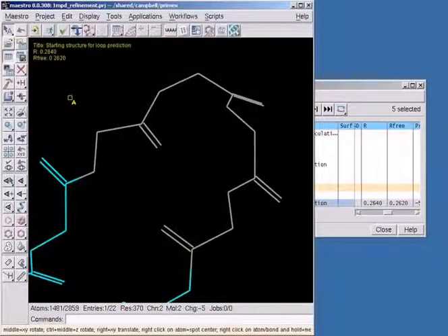In Primex, the primary tool to refine the backbone is called loop refinement, or loop building. Primex uses an all-atom force field and a well-validated loop building algorithm adapted from Schrödinger's protein structure prediction package called PRIME. But, as we saw earlier, the inclusion of hydrogen atoms in the output structure is a setting that can be either enabled or disabled by clicking on the Calculation Settings button when setting up a Primex job.